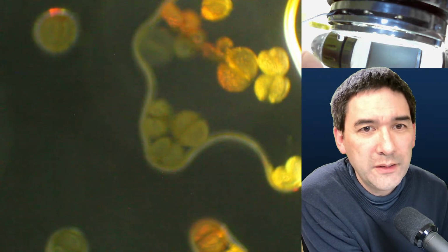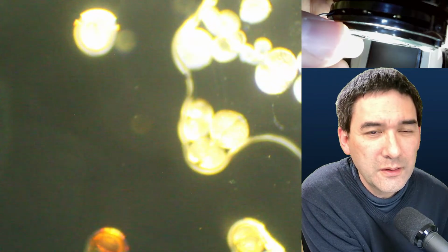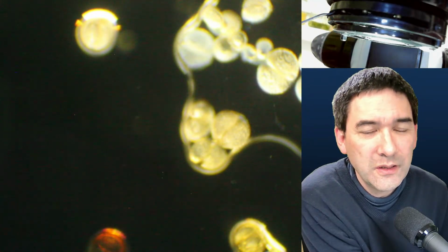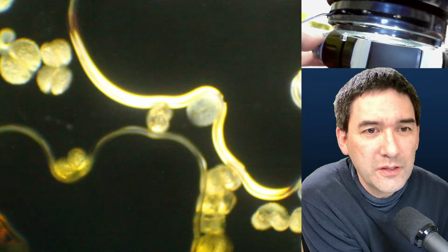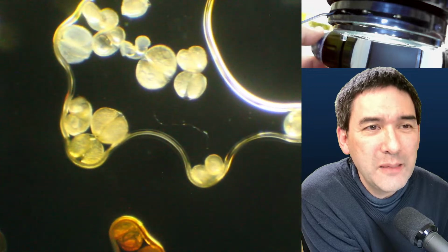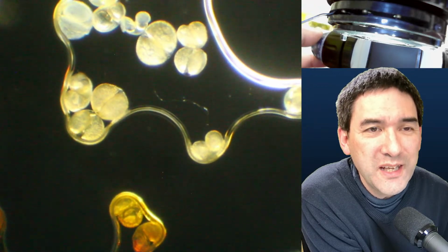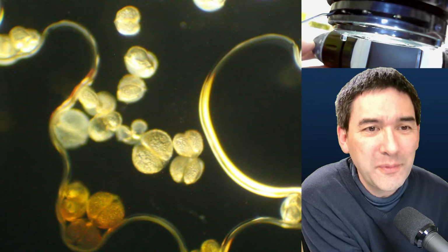So let's try darkfield again. Bright. A little bit. There's a second here. Yeah, the condenser was not... This is how this one looks like. But again, even here, it's interesting. Even here, we are able to see the surface texture of the pollen better. Something I was not able to see.